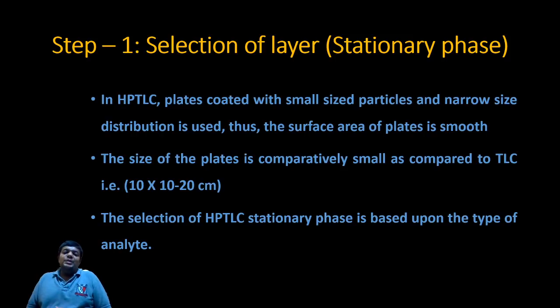The selection of the HPTLC stationary phase is based upon the type of analyte. So what type of analyte is there? A similar type of plate stationary phase you will select.